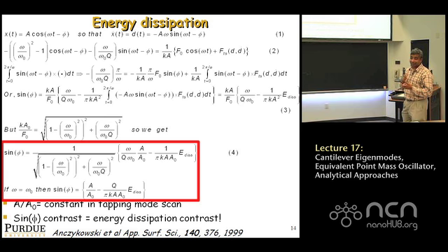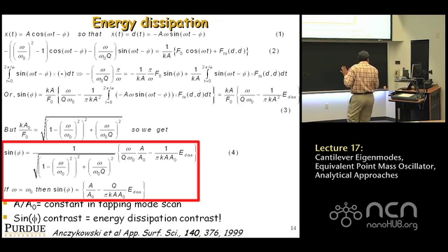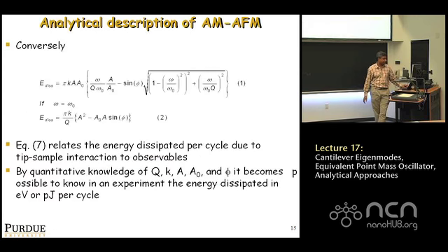Sine of phase is basically giving you energy dissipation over sample. Fantastic. Energy dissipation between a few hundred atoms as they quickly approach and move away. Amazing, if you think about it. I still get excited by the very thought that you can measure. And these numbers are typically in air, a few electron volts. It's just amazing, it's really remarkable. Or picojoules, if you like, mechanically thinking about it.